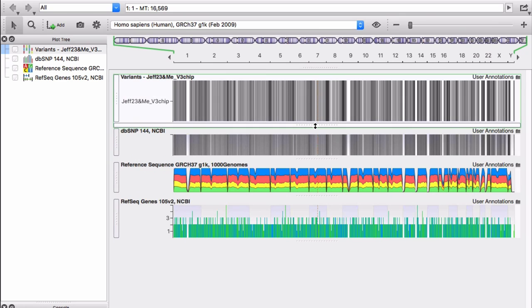You're looking at more than a half million SNPs displayed across your genome. We'll learn how to zoom in to examine individual SNPs in an upcoming video.